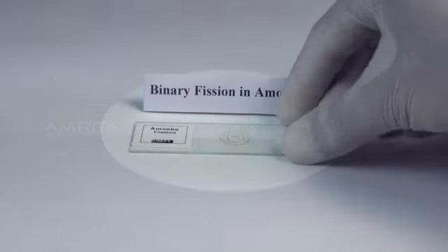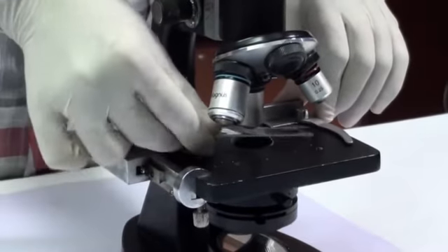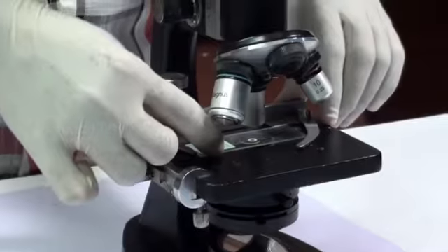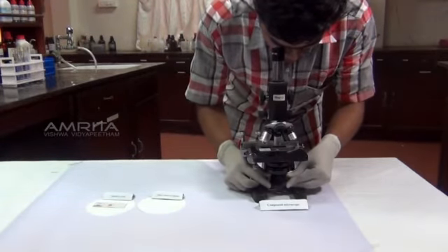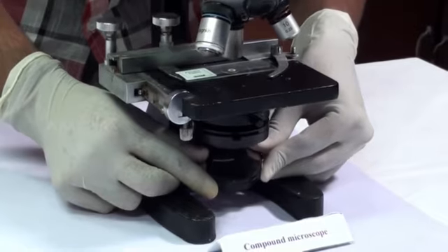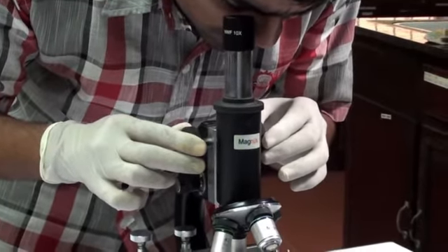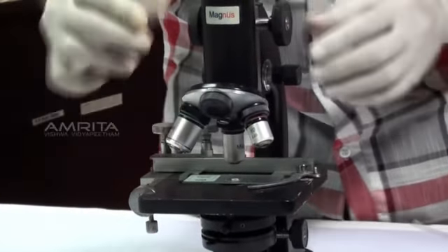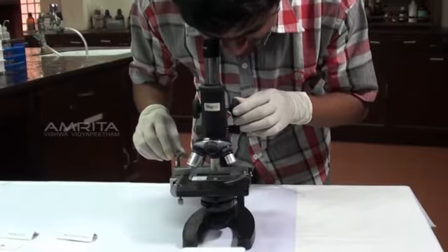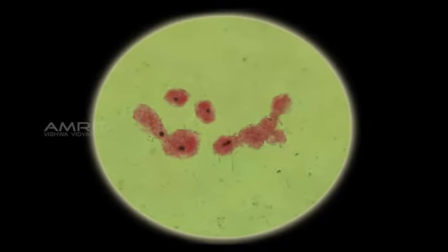Take the permanent slide of binary fission in amoeba and place it on the stage of the compound microscope. Adjust the mirror of the microscope carefully until the image you see has the maximum clarity. Focus the slide under the microscope's lens carefully, first under low power and then under high power. Observe the different phases of binary fission in the amoeba through the lens of the compound microscope.